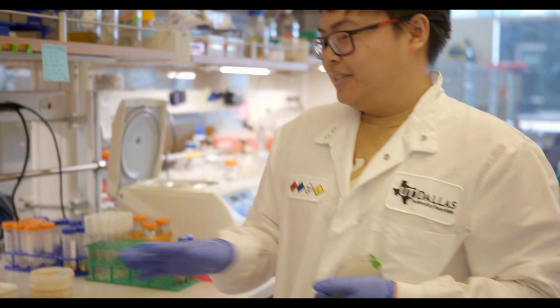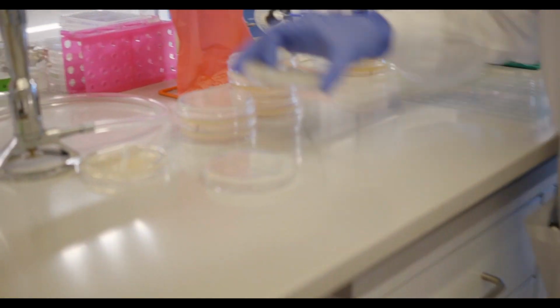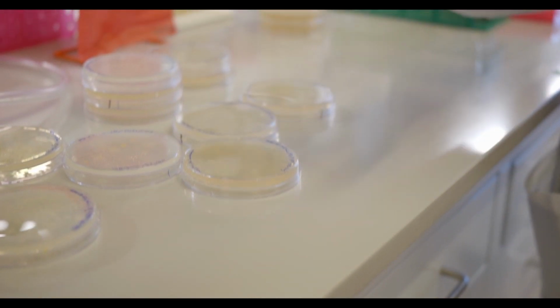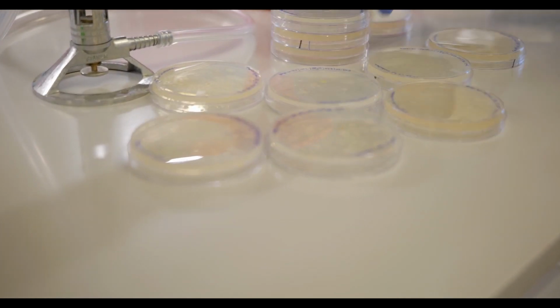To do that, I'm just plating a lot of soil, and here there's a bunch of different bacteria, and then what I'm going to eventually do is select whatever bacteria I'm interested in.